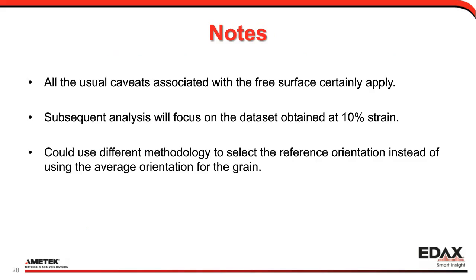Just the usual notes, all the usual caveats apply with a free surface. That's what we can do in situ. We can't look in the bulk with EBSD, so we certainly know that it isn't necessarily completely representative of the bulk, but we hope it gives us some indication of what's happening. We're going to focus on the data set at 10% strain because that's the critical one, and compare it to the one at 0% strain.